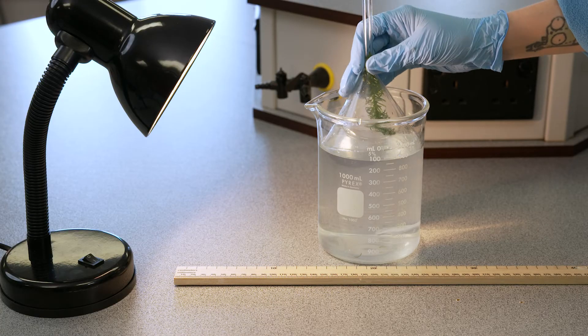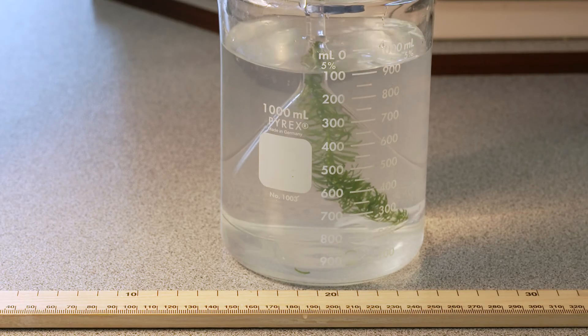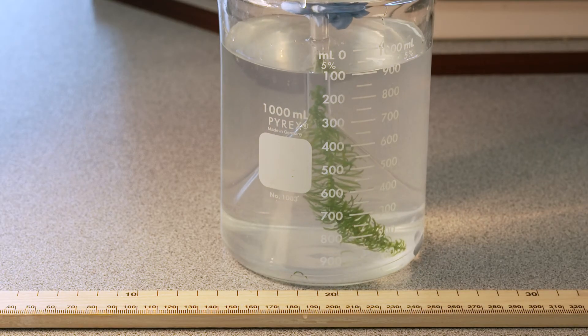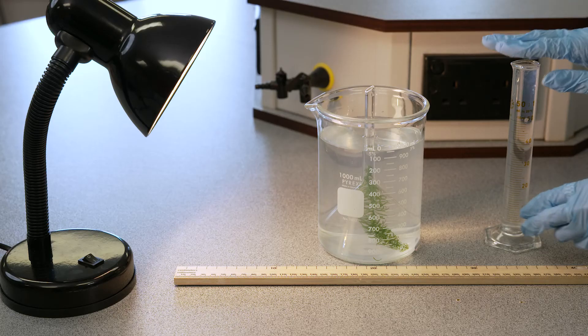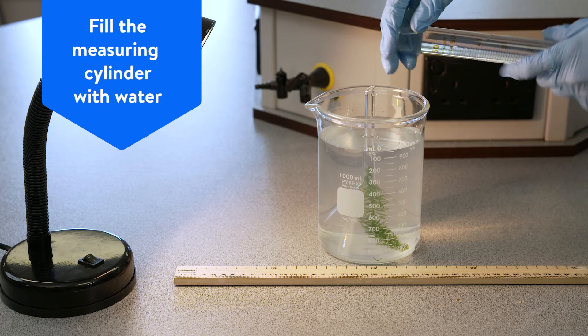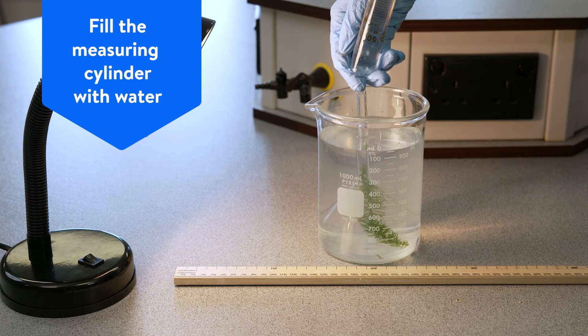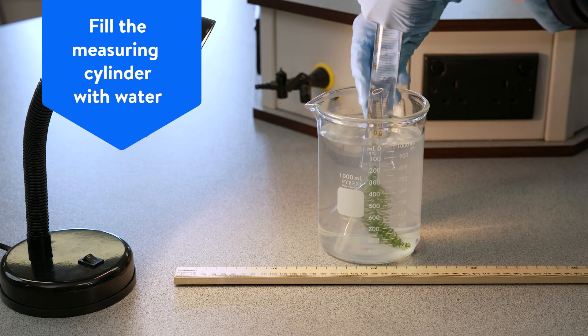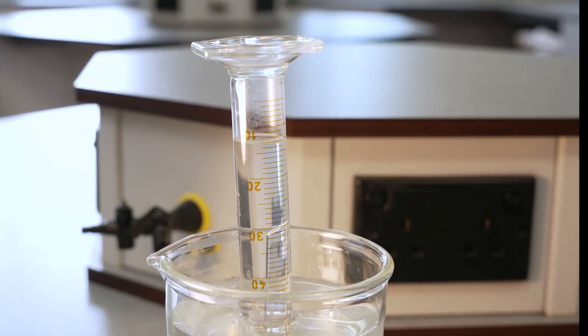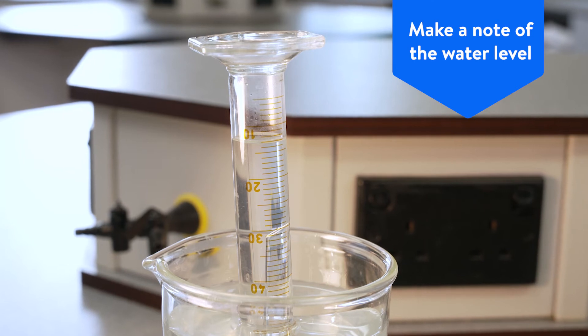Fill the measuring cylinder with water and carefully position it over the stem of the filter funnel. Make a note of where the water level is in the cylinder.